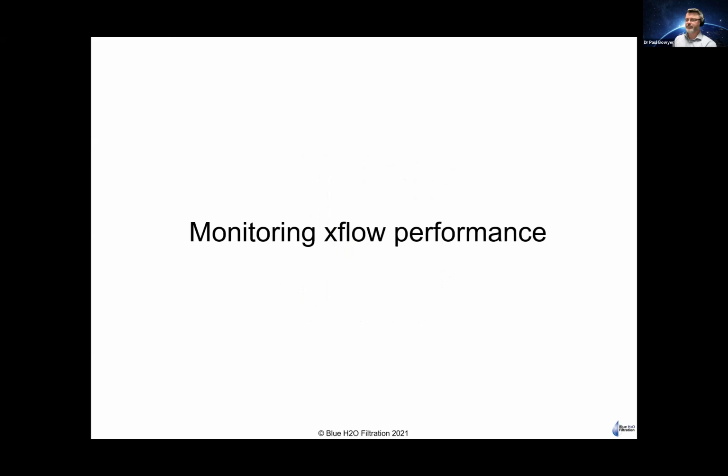And just lastly, one other thing you can do with filterability that many people aren't aware of is you can actually monitor your crossflows, just to make sure it's functioning as it should. In general, crossflows should spit out wine that has an index of certainly less than 5 and ideally around 1, 2 or 3 seconds for the primary index, something like that.